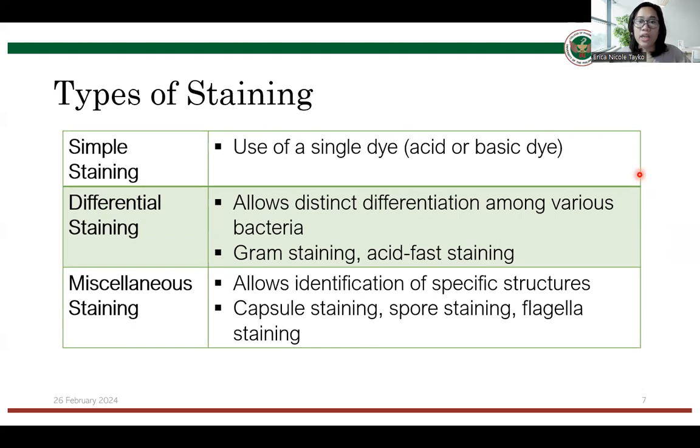Di ba, there's a primary stain and then there's a counter stain and other reagents as well such as your mordant and also your decolorizers. So, when we only employ the use of only one stain, that is your simple staining technique. We did not perform this anymore for exercise 4, but we were able to perform this during your microscopy exercise wherein you used methylene blue when you tried to view your Lactobacillus casei and your Bacillus clausii samples or specimens.